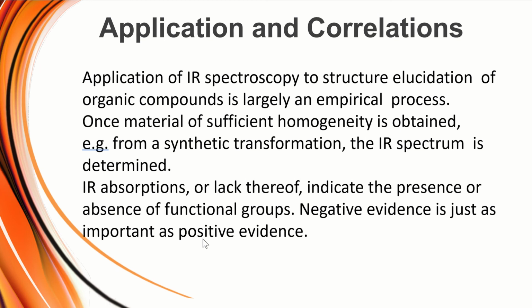This is important because when you look at a spectrum, it's not only important to say what is there, it's also important to say what is not there, right? Negative evidence is just as important as positive evidence because that will rule out certain things.